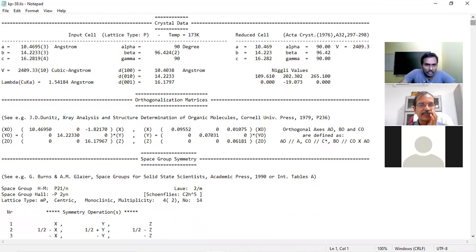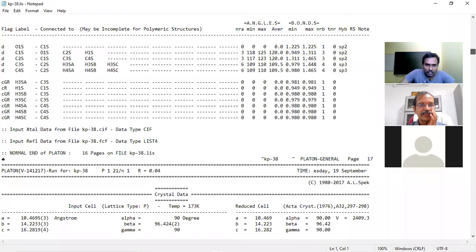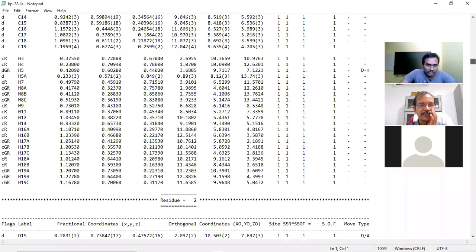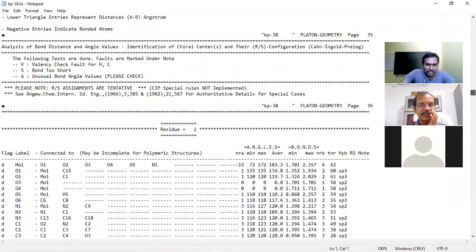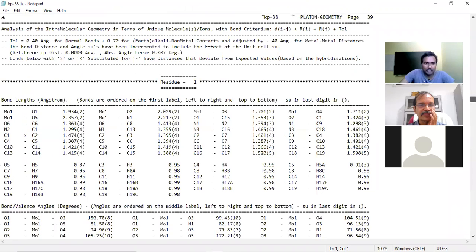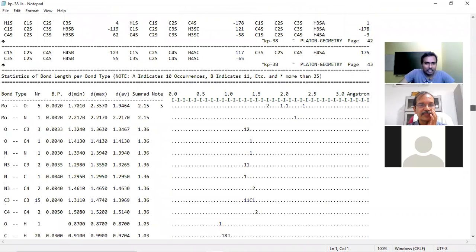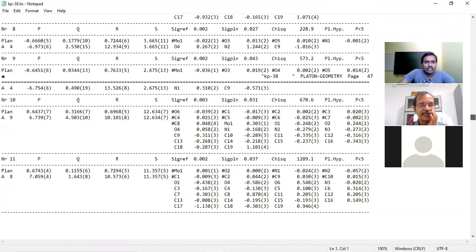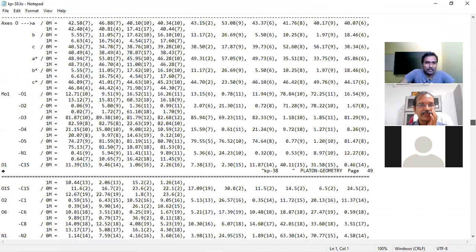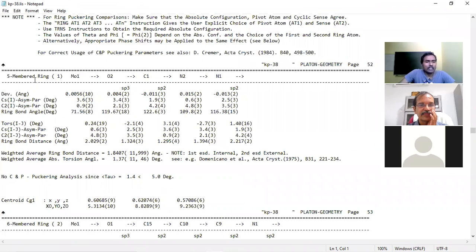Then you can go down, and in the middle we can see the pi-pi interaction table. If you're familiar with this file, then we can easily find it. Otherwise, the first time it will be difficult to search and find the exact place where the pi-pi interaction table is, and later it will be easy. So these are the ring interactions.